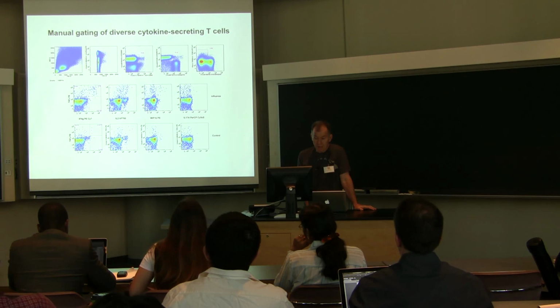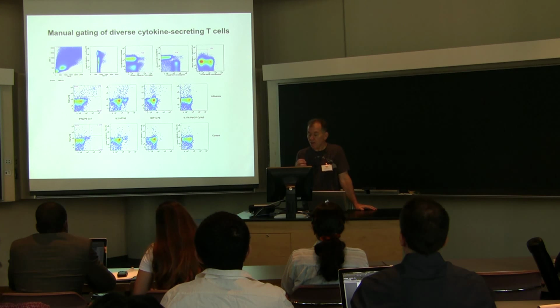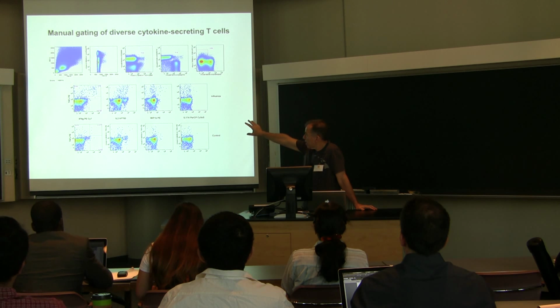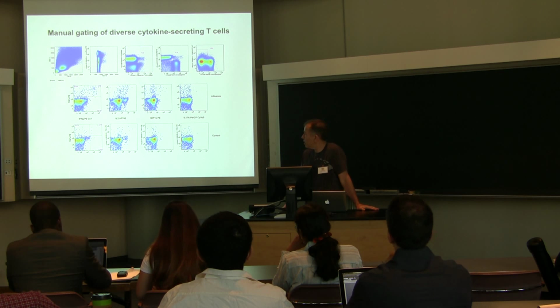With the manual analysis that Richard described, there's an extra problem for going after the cytokine secreting populations that we're very interested in. They're very rare. As you can see from some of these plots, when you get down to an activated set of T cells, the cytokine production tends to be not plus/minus markers. They tend to smear out a bit. They're sort of low, medium, high. It's hard to decide where exactly everything is.